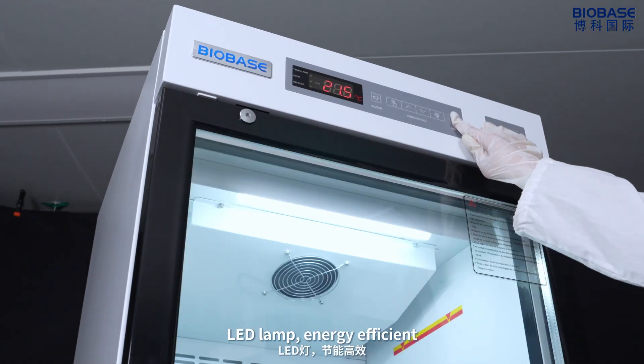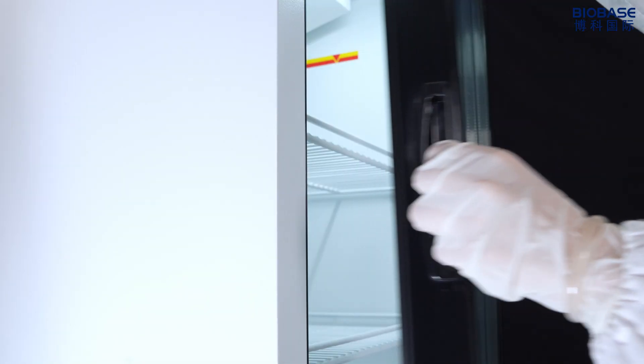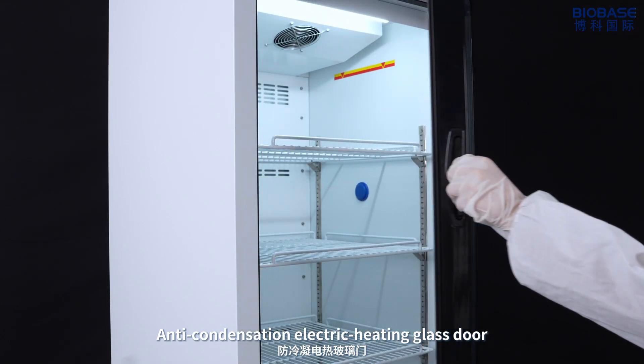LED lamp, energy efficient. Anti-condensation electric heating glass door.